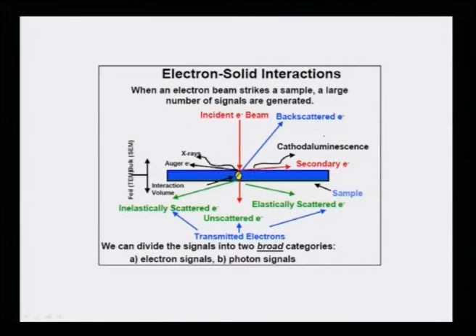As I showed you in this slide in the beginning of the discussion on the microscopic techniques, as the electron falls on the sample, it generates all kinds of signals. You can have secondary electrons, or backscatter electrons, which is very standard. You can have X-rays, or Auger electrons, or cathodoluminescence coming from the top surface of the sample, where the electron is falling.